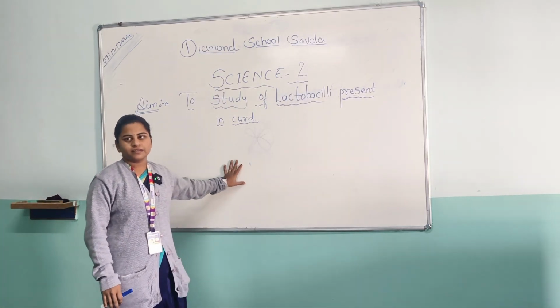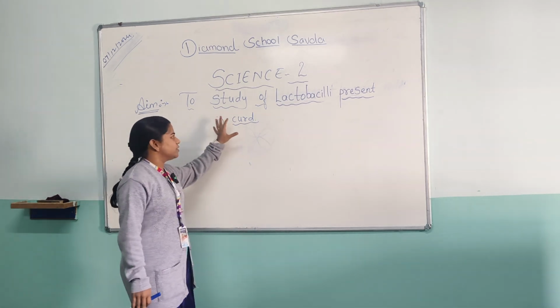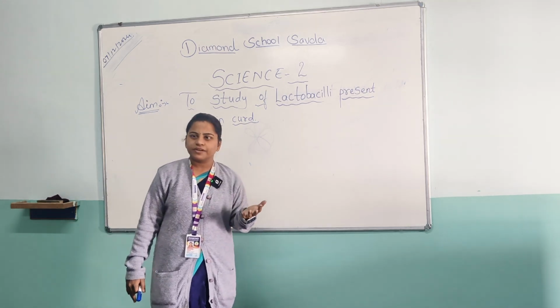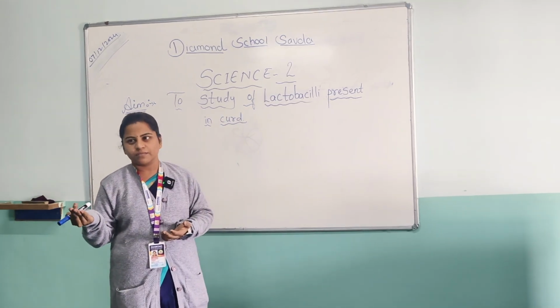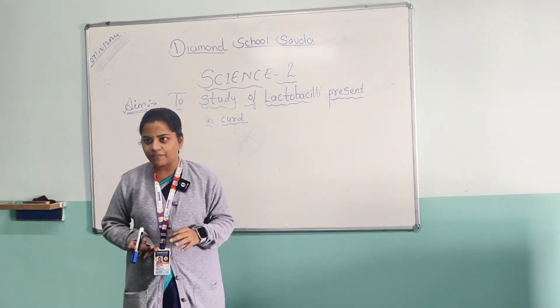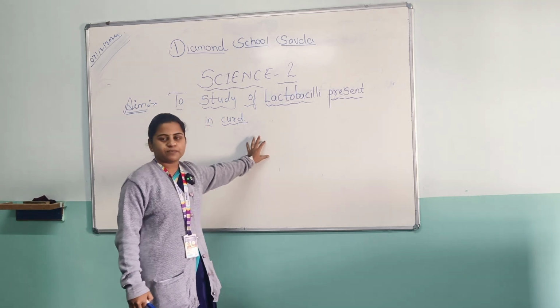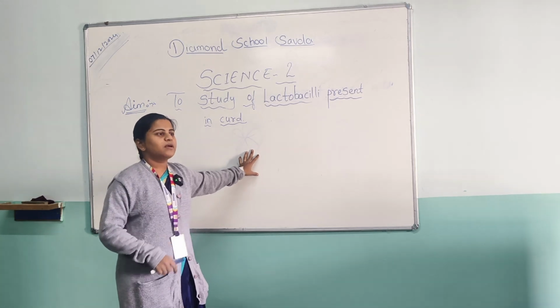Good morning, students. Today we are going to perform a science practical, and our aim is to study lactobacilli present in curd. In common language, curd is known as dahi. In theory lectures, we had studied different types of microorganisms, useful and harmful. Useful microorganisms are those that help in our daily life. One of them is lactobacilli, which is present in curd. So we have to see lactobacilli by performing the practical.